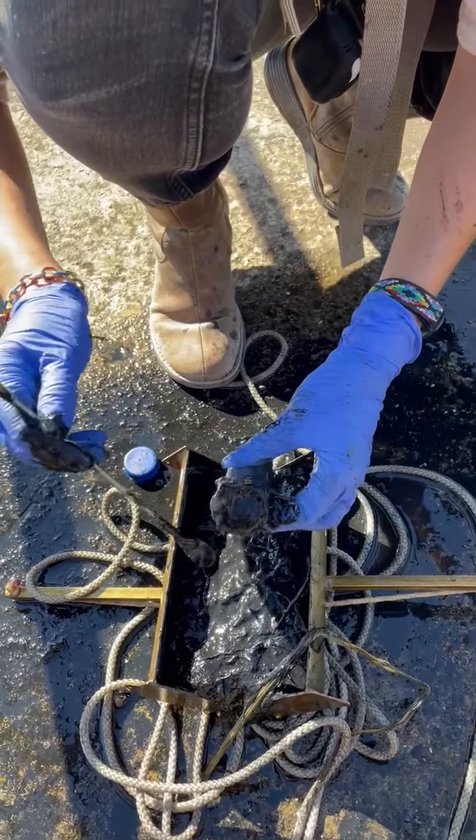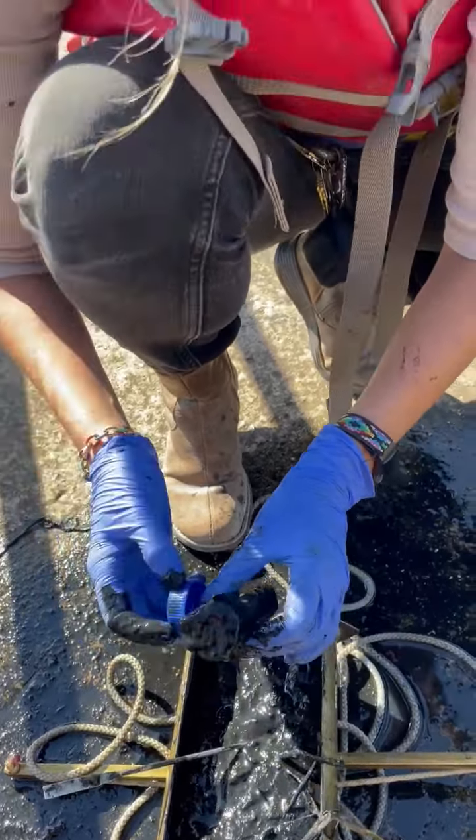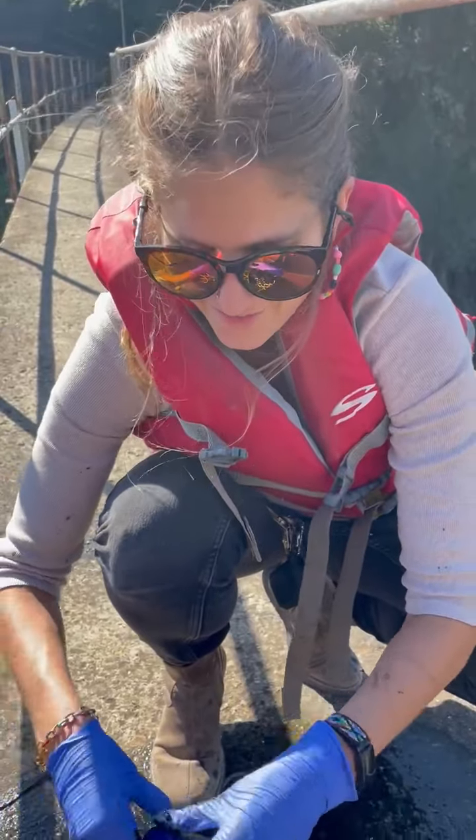Okay and we fill it up and then we are going to use this to do DNA extractions. How do you feel? Great. I feel really dirty.